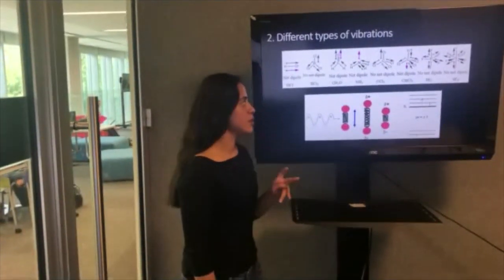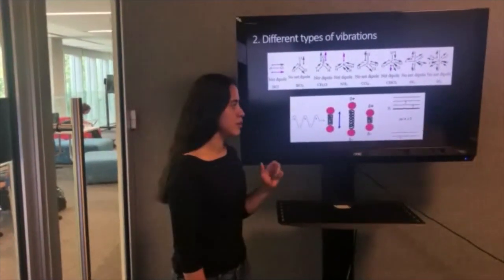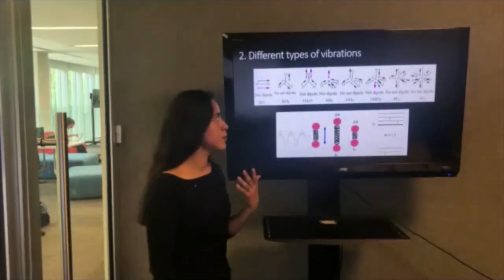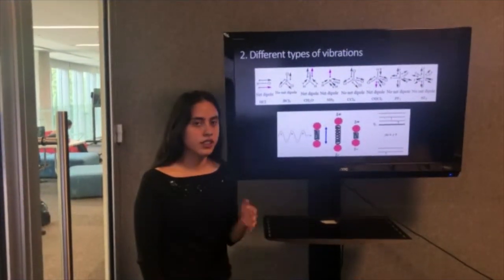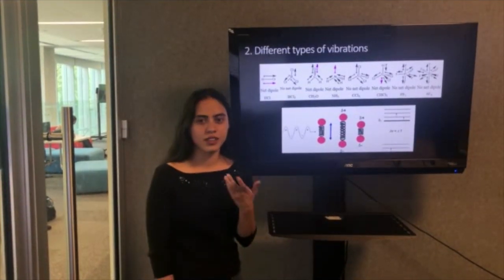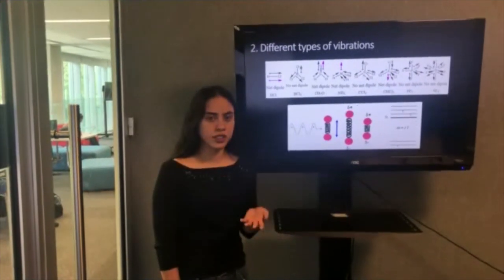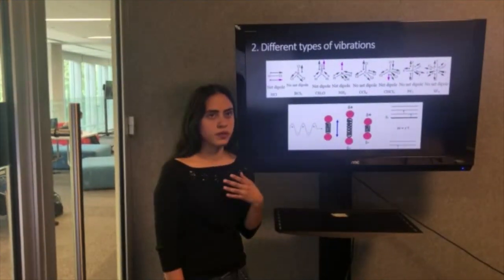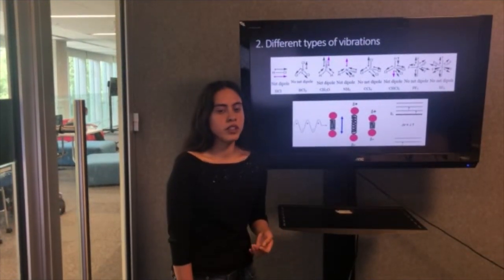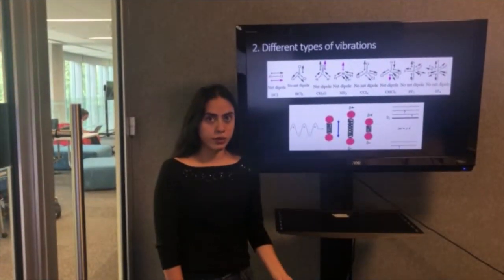An interaction between the infrared radiation and the vibrational states is only possible if the electric vector of the incident radiation oscillates with the same frequency as the molecular dipole moment, and it produces an absorption of energy in the form of resonance. A vibration is infrared active only if the molecular dipole moment can be modulated by a normal vibration.